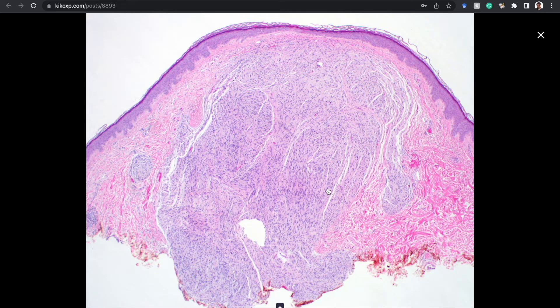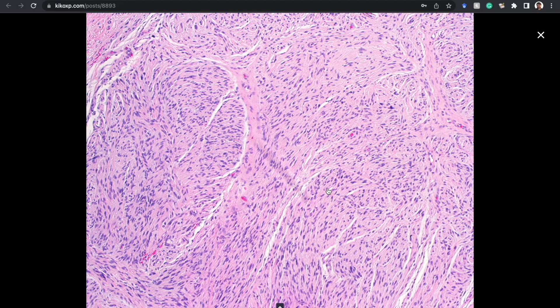I wouldn't have called this one plexiform personally — it does branch a little, but I'd just call it palisaded encapsulated neuroma. The main difference from schwannoma: there's no real capsule, and even though there's palisading it's more vague without nice Verocay bodies. The best differentiating feature is clefting artifact — crack-like spaces around these fascicles of spindle Schwann cells. That's really helpful. You can also do a neurofilament stain; there tend to be more neurofilament components in neuromas.